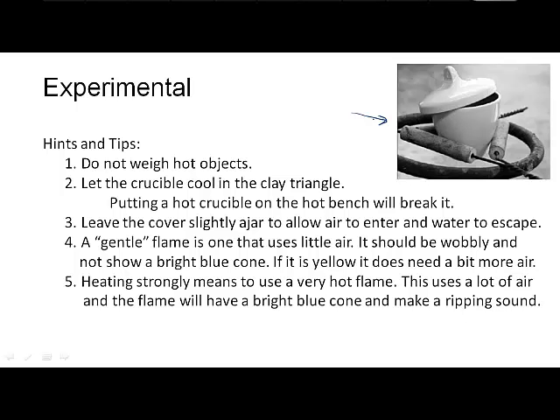Leave the cover slightly ajar as we show here when you're doing the reaction because that will let water evaporate to escape if it's evaporating. It'll also let oxygen in from the air if you're reacting with oxygen. So be careful about that when you're doing it so it doesn't fall all the way off.